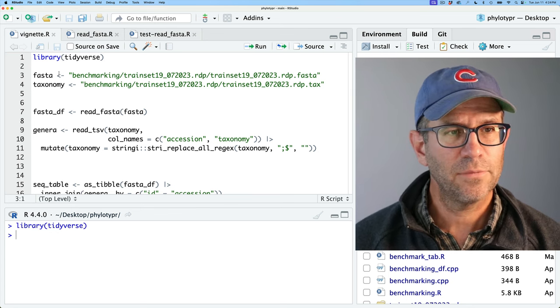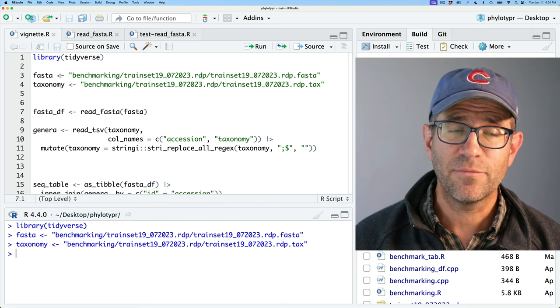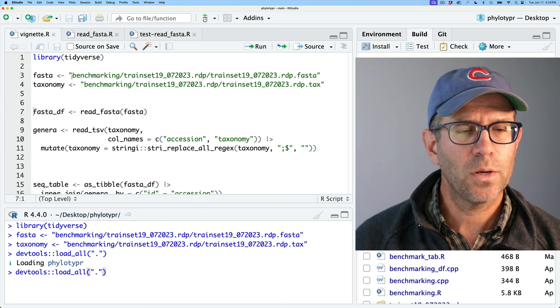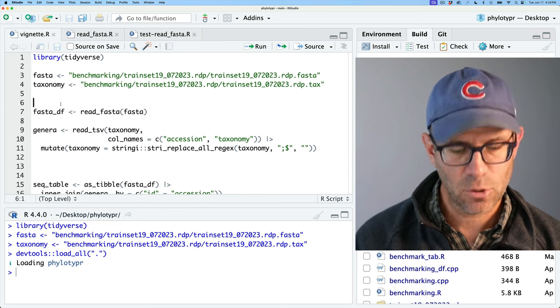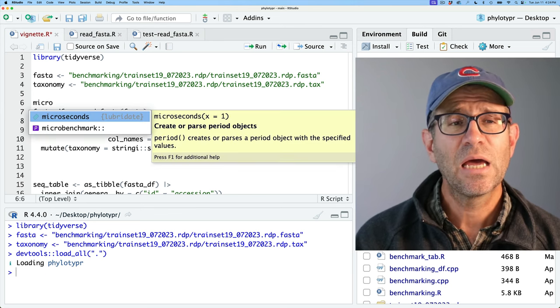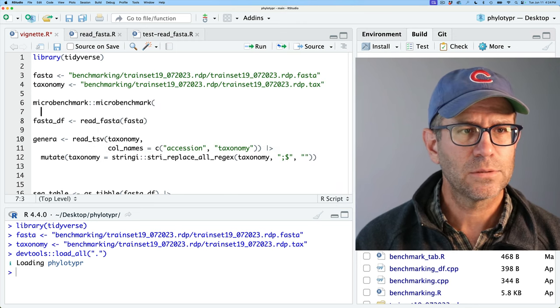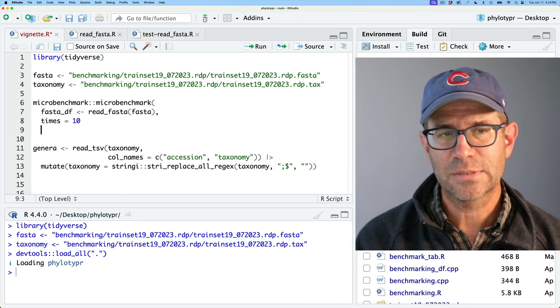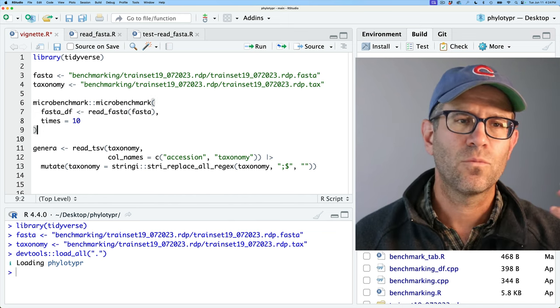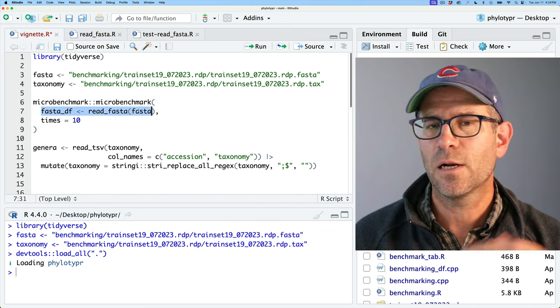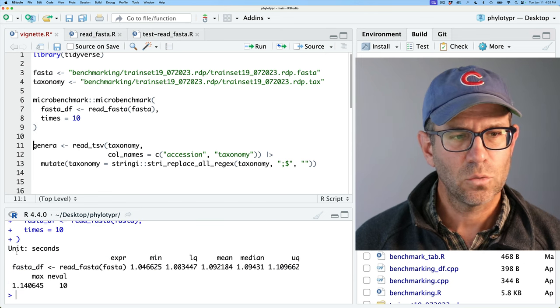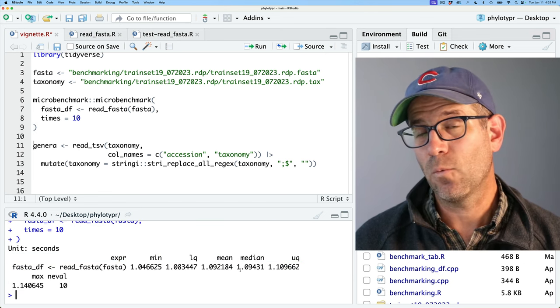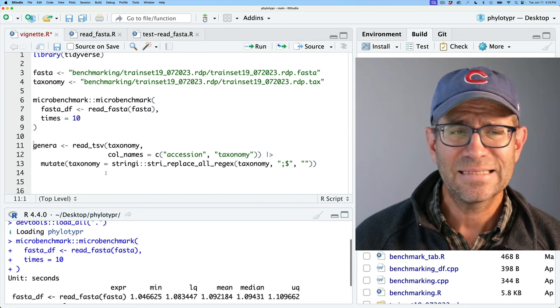I'll go ahead and load the tidyverse as well as my FASTA and taxonomy file names, and load the package. I'm going to wrap this in microbenchmark to get a sense initially of how long it takes to run, using times equals 10 to do 10 reps. It will report summary statistics. This is in units of seconds, so we see that the median or mean is about 1.09 seconds.